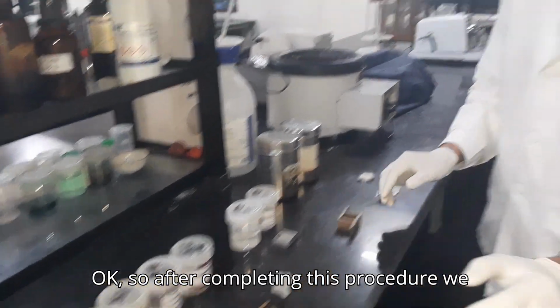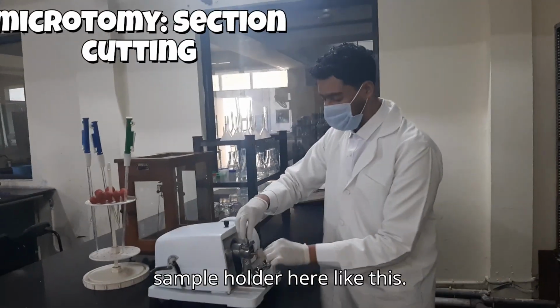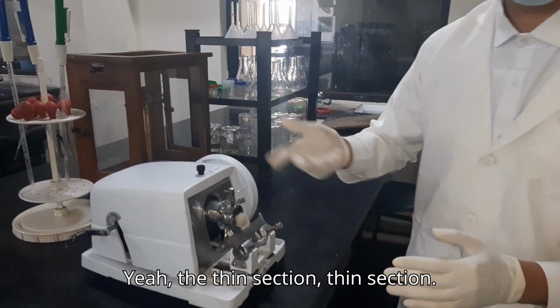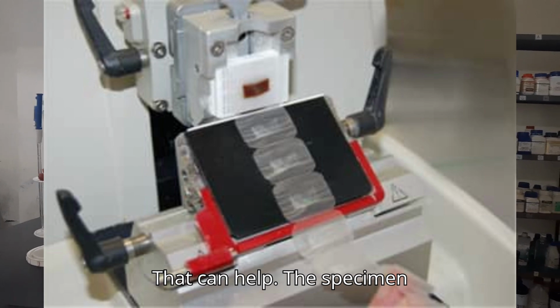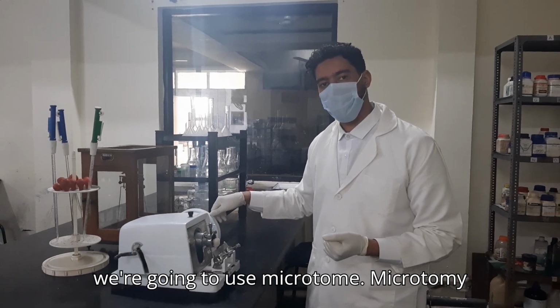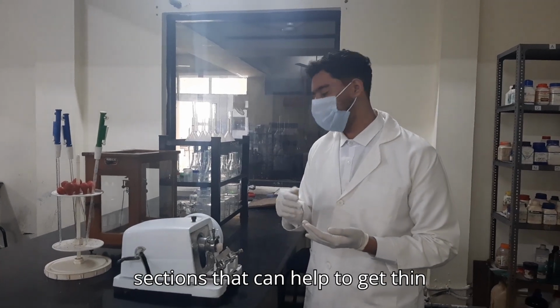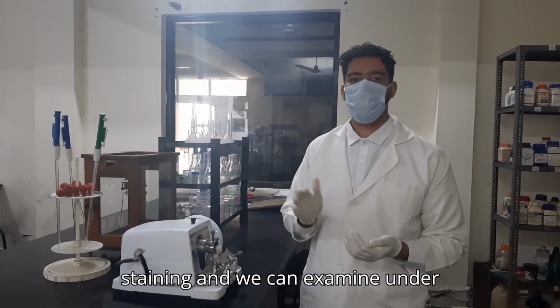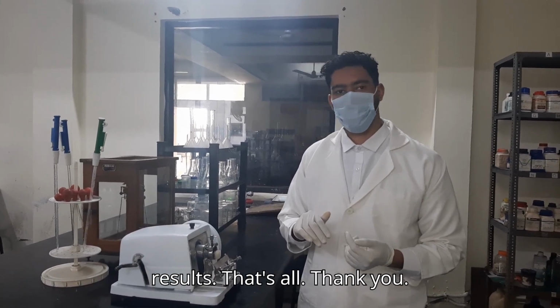After completing this procedure, we put the sample holder here, like this, in order to make thin sections that help the specimen to be examined under the microscope. So we are going to use microtomy. The microtomy procedure provides thin sections, so that we can do the proper staining and examine under the microscope in order to get clear results. That's all. Thank you.